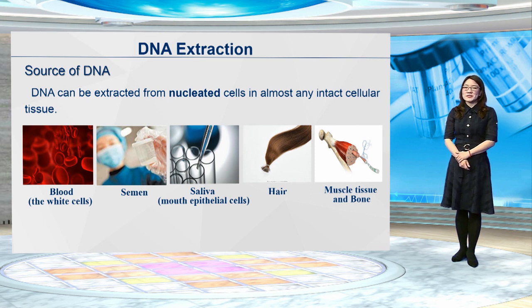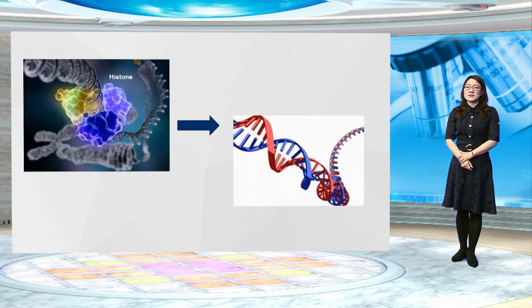A biological sample obtained from a crime scene in the form of a blood or a semen stain, or a liquid blood sample from a suspect or paternity testing case contains a number of substances besides DNA. The DNA molecule must be separated from other cellular material before it can be examined. Cellular proteins that package and protect the DNA in the environment of cells can inhibit the ability to analyze the DNA. Therefore, DNA extraction methods have been developed to separate proteins and other cellular materials from the DNA molecule.